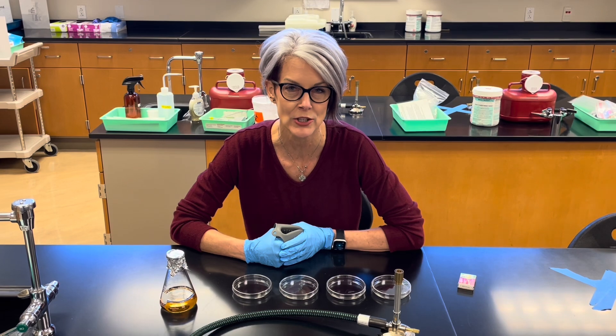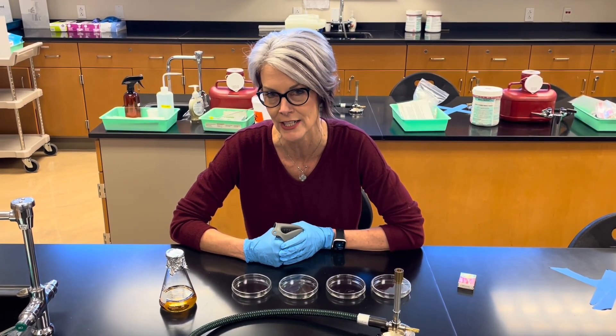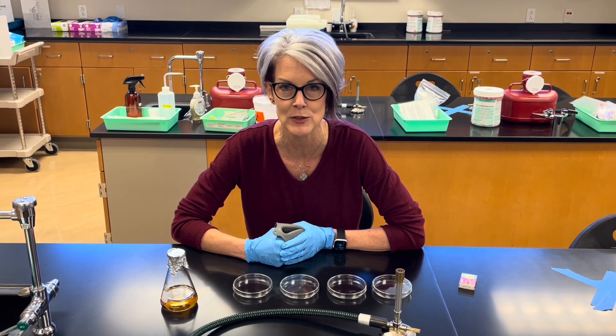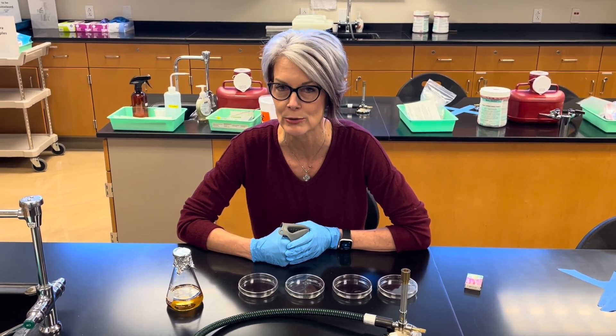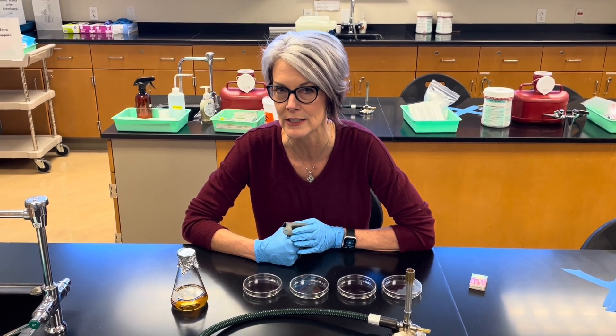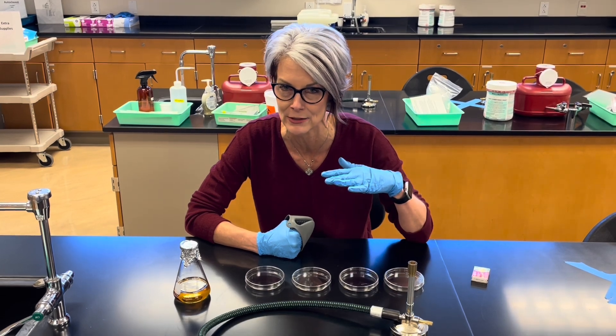To sterilize the media, it's placed in an autoclave at a temperature of 121 degrees centigrade with 15 to 20 pounds per square inch of pressure, and we autoclave it for about 15 to 20 minutes. So it's going to be quite hot. We place the flasks at 60 degrees centigrade to cool them down a little bit.